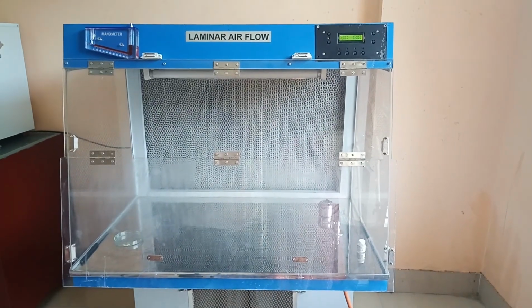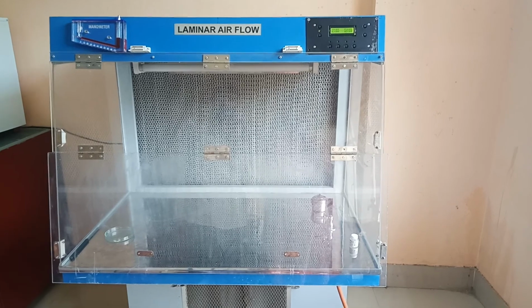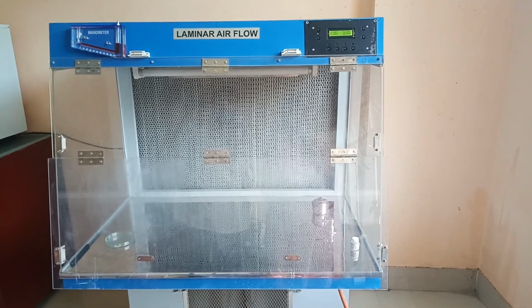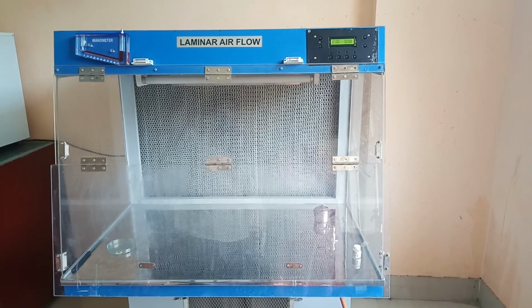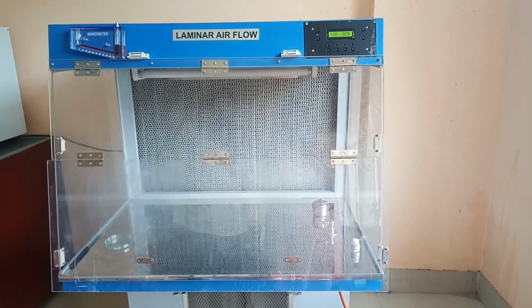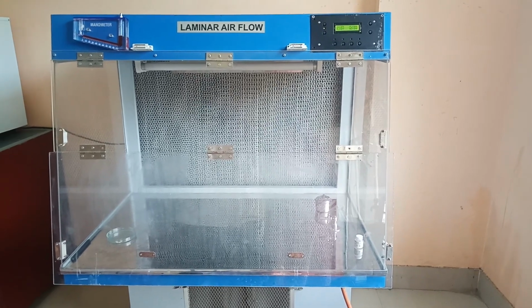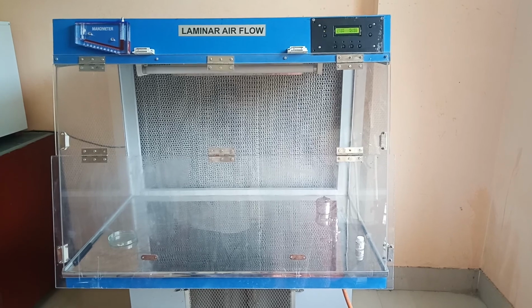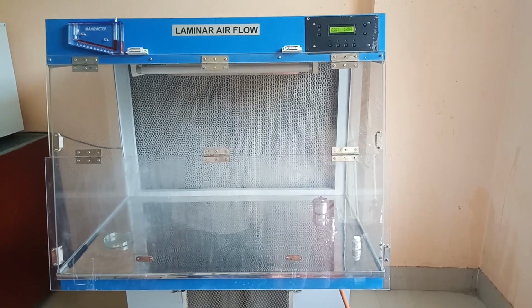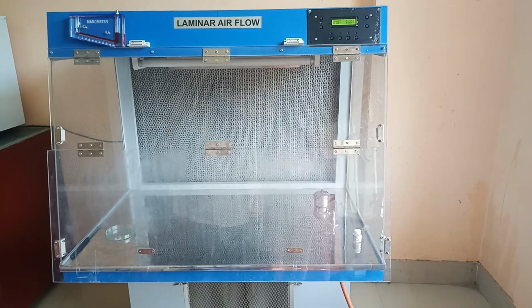Hello everyone. This video is to explain the working and functioning of laminar airflow. Laminar airflow happens to be one of the most important pieces of equipment in a microbiology laboratory, wherein we carry out almost all microbiological experiments, starting from inoculation of microorganisms to staining to plating and so on. Herein, first of all, we need to understand the different components of a laminar airflow.